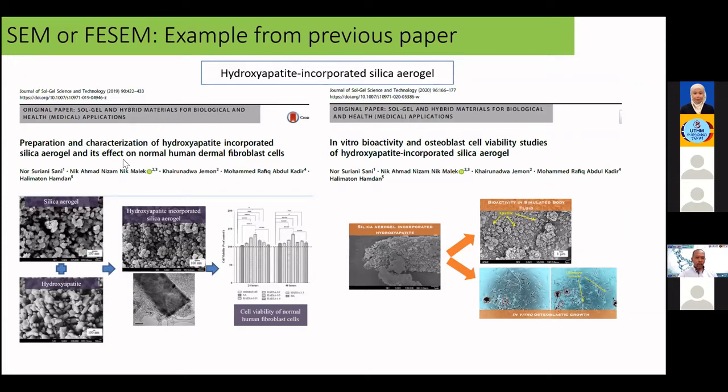When we synthesize nanoparticles, these are the most important techniques: FESEM and also TEM. So here is FESEM and also TEM, and this is not TEM. This is the picture of the cell. This is a simple microscope only. But it's important to have a FESEM if you want to characterize a nanoparticle.